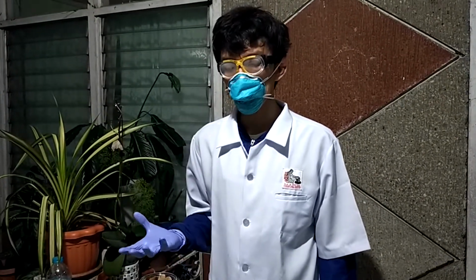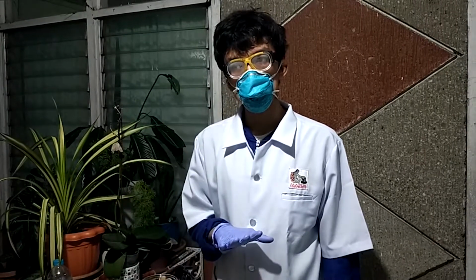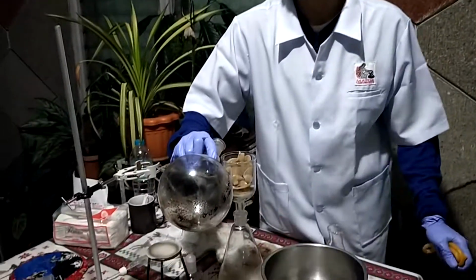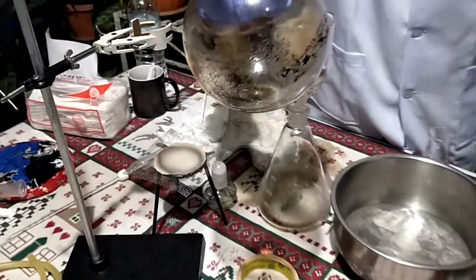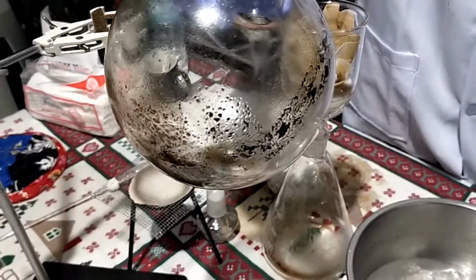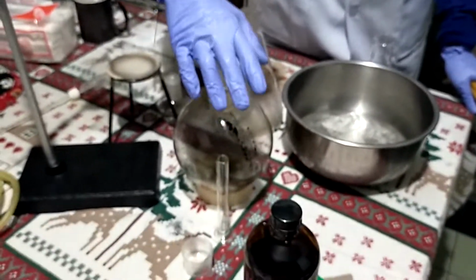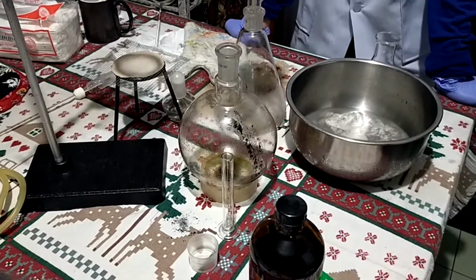Therefore, as a recommendation, instead of 45 milliliters of ethanol, I got careless because there was still a lot of ethanol stuck in the caffeine rather that was stuck in the bottom of this flask, which made me realize that I used too much ethanol.